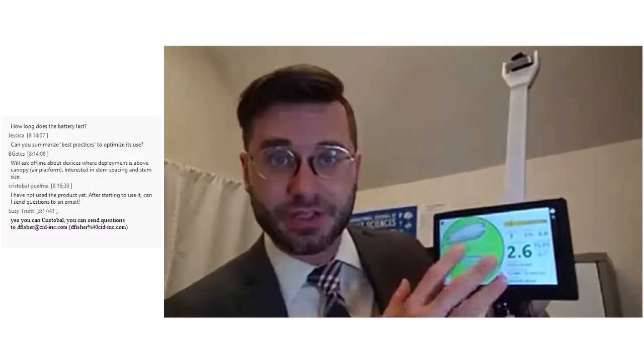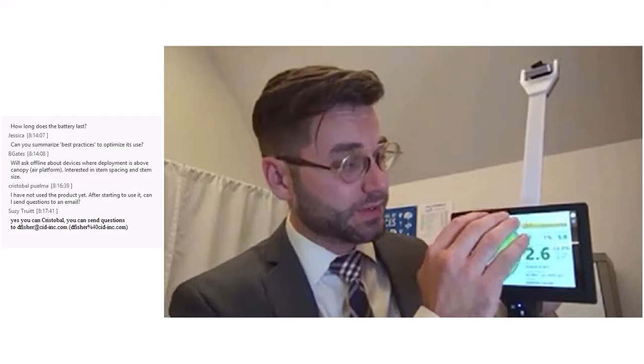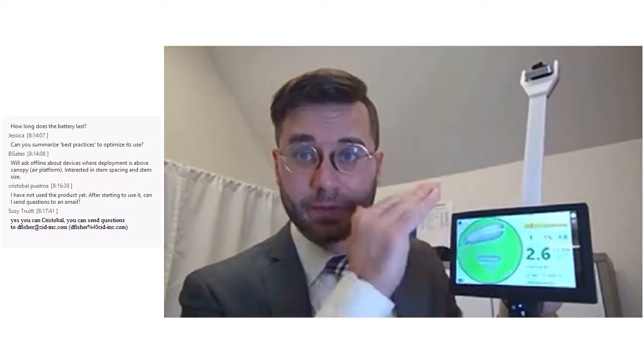Simply, it's just going to be a lot higher contrast. You're going to get a lot better definition in between your leaves and your sun, but you're also going to get harder definition between different types of leaf and patterns there. And that's just pretty common across any leaf imaging. But this actually calculates a lot of the data and tries to account for that. So you're fairly safe either way when it comes to using this imager.